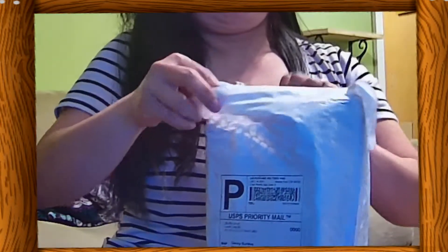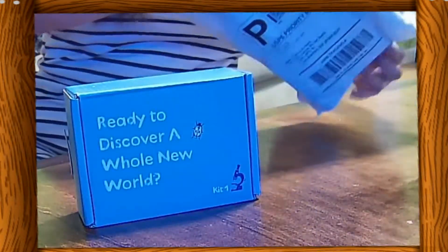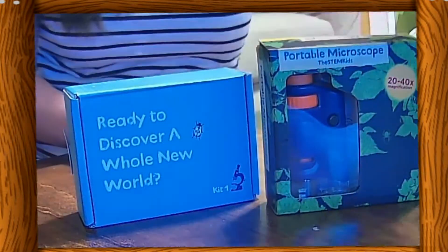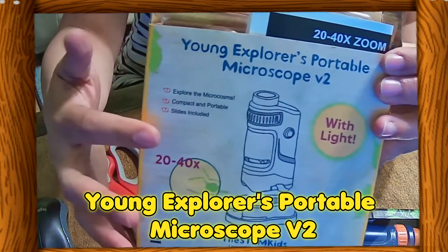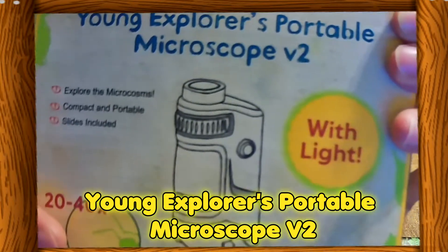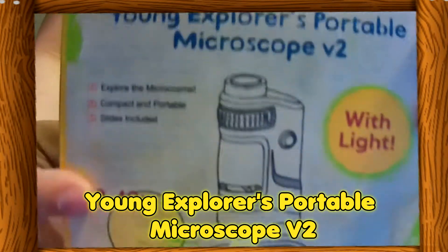Take note: real specimens. So I already tried and used this portable microscope. This is the Young Portable Microscope V2. This microscope has 20 to 40 times magnification, is very compact and portable, has three slides included in the box, and it is super children-friendly.